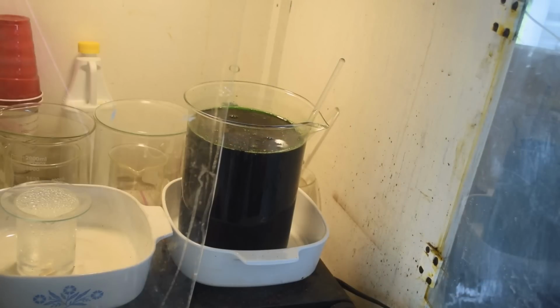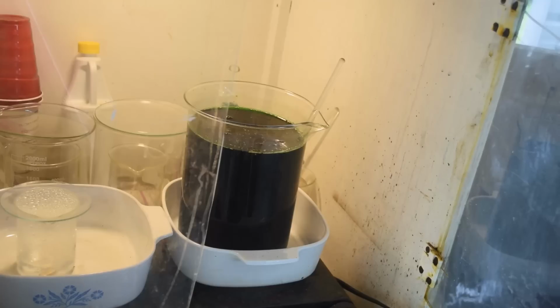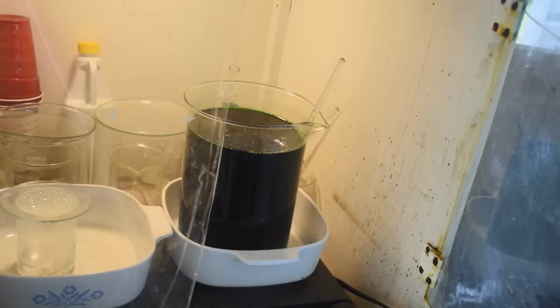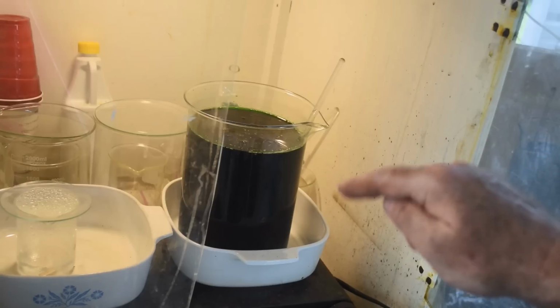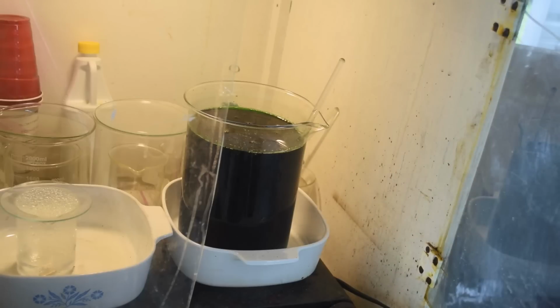But some of you may be thinking to yourself, well, Mike, you just boiled this stuff down to concentrate it, now you've just diluted it again. Yes, there's a technical term for what I'm doing here, and it's called fixing my screw up. All right, so we're going to have to get a lot of this stuff back into solution to deal with my oopsie of using way too much potassium nitrate in the poor man's nitric acid. So I got to get that stuff back into solution. Now, hopefully, any solids that won't go back into solution will be palladium chloride. And I can just add that stuff to that beaker of denox liquid.